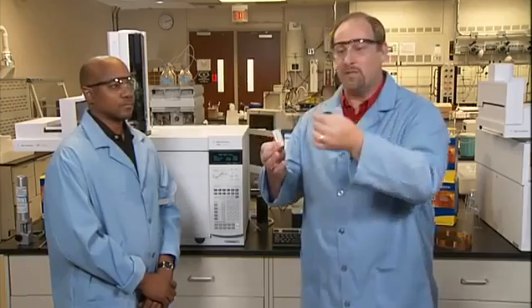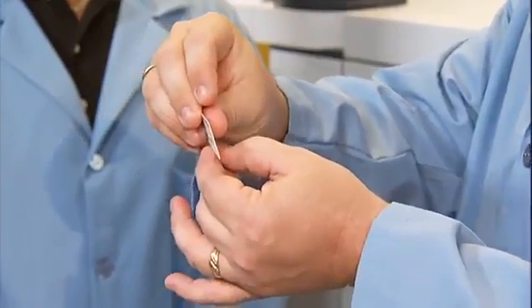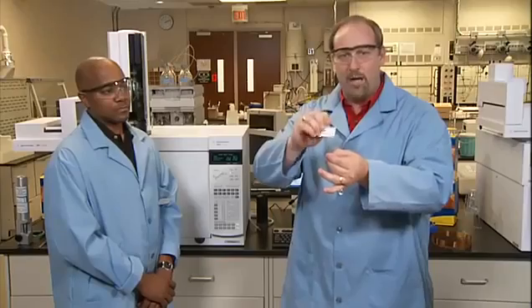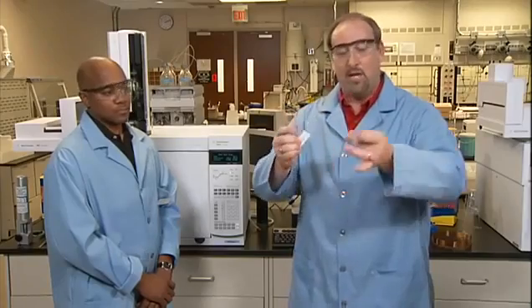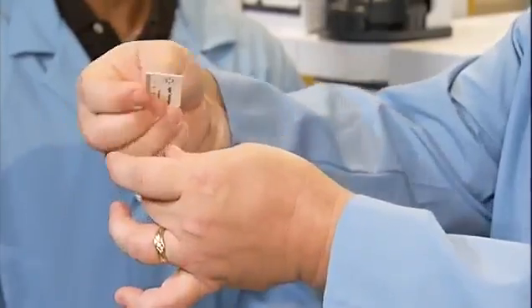We simply take the column, hold it in one hand, and for ease of purposes, I'm holding it out in front of you, just a section, and then I take my ceramic wafer. There's a rough side and a smooth side as you feel the edges of your ceramic wafer. Take the smooth side and just score the column to go through the polyimide and just nick the glass. It shouldn't break at this point, but you should be able to apply a little stress to the column. It should break easily, and then you can remove it.